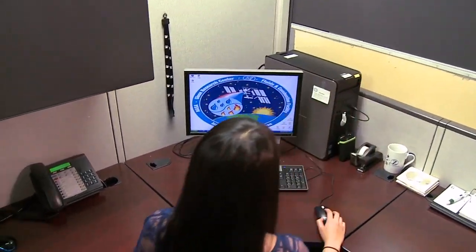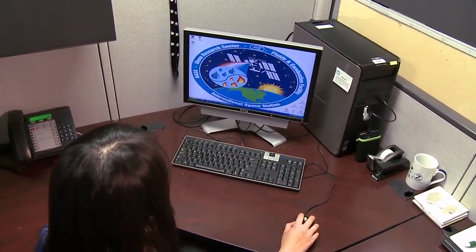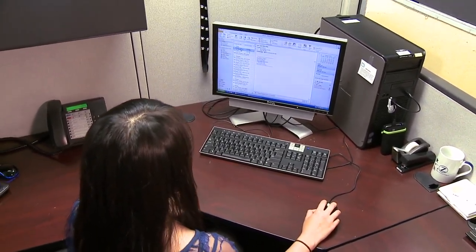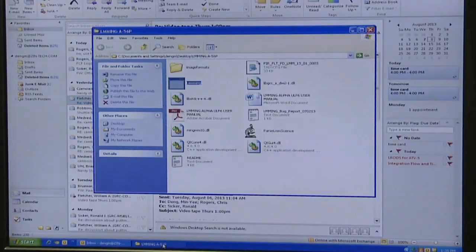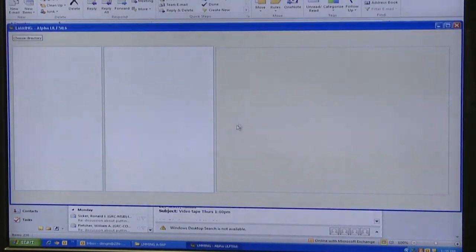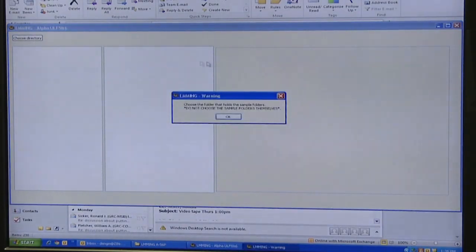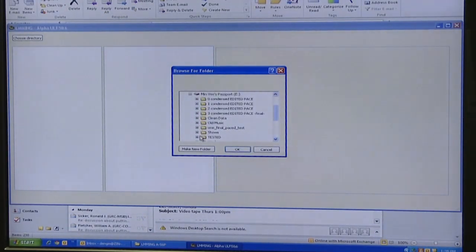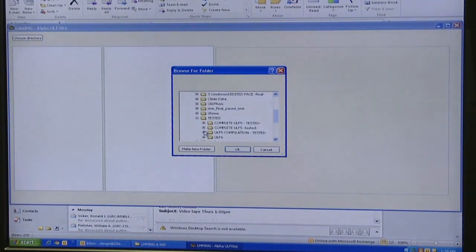When you want to download LMM onto your computer, you have to download an entire file. What's in this file is a lot of data and supporting files that are important for LMM to work. Basically, how you interact with LMM is you open up this file and all you have to do is click the executable. You do not have to worry about any of the other files that are in the folder.